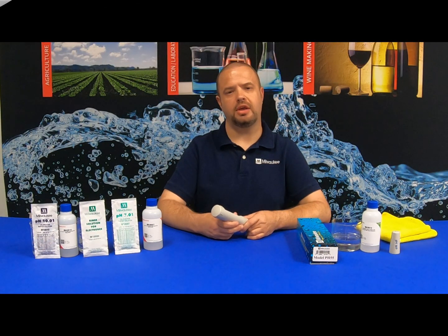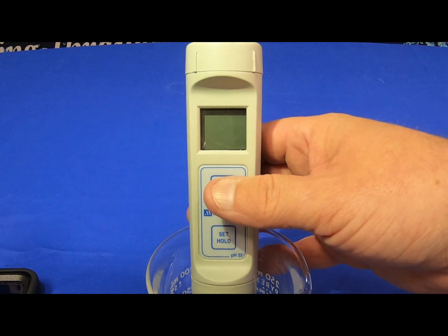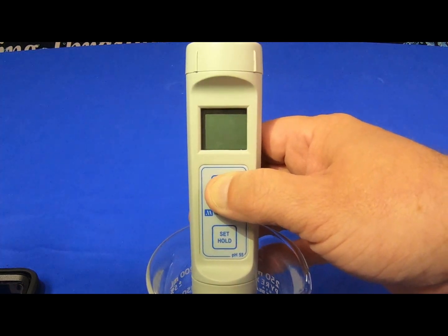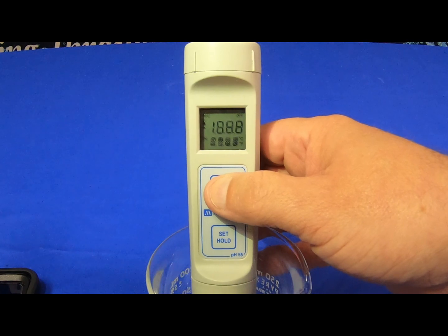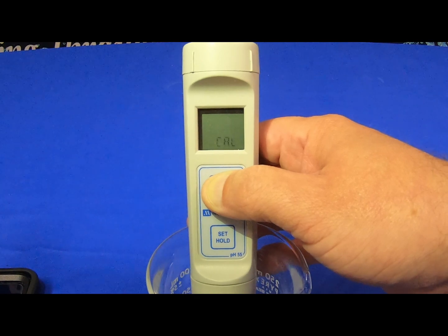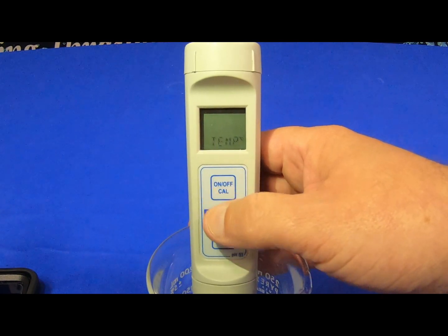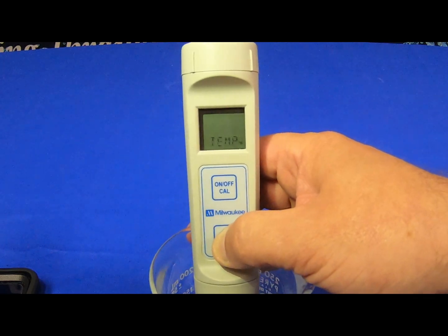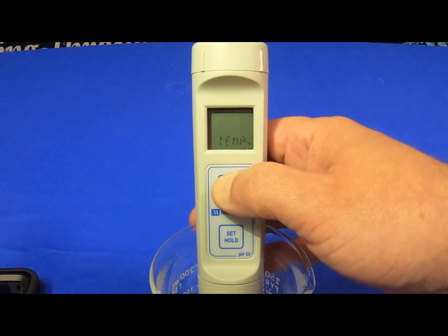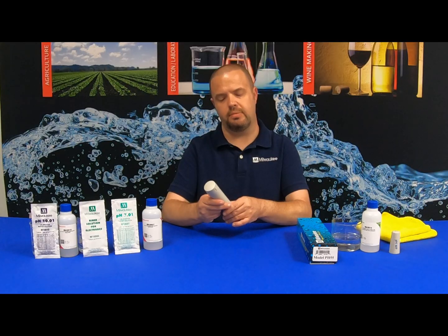With the Milwaukee Instruments PH55, you have the ability to change the temperature from Celsius to Fahrenheit. Simply turn your unit on and wait for the display to pop up. Once it pops up, hold the on-off cal button until it displays TEMP. Once it displays TEMP, release, then hit the set hold button to alternate between Celsius and Fahrenheit. Once done, hit the on-off cal button to go back to the main menu.